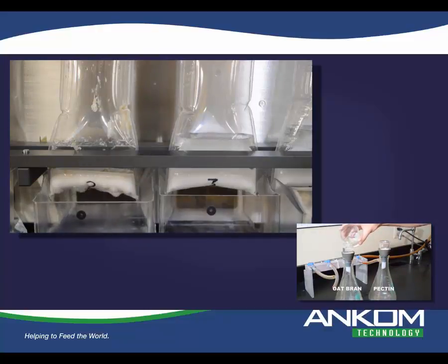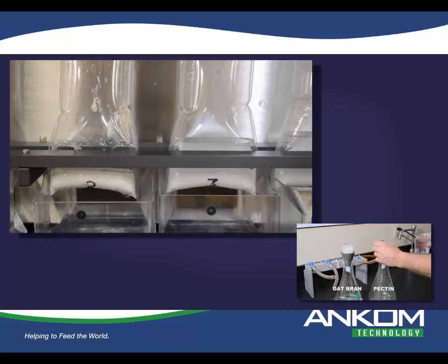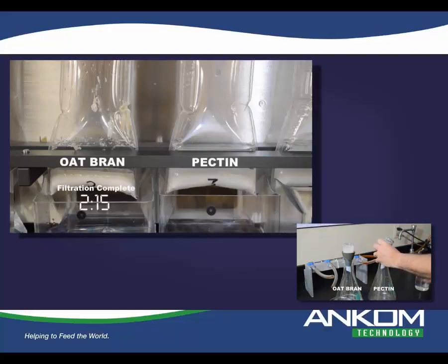When you do the filtration with the gooch crucible, remember you're taking a size of solution. For instance, in the upper digestion, when you're doing the enzyme digestion, you have about 50, maybe slightly more than that because of rinses, milliliters of solution that you're putting into the 60 milliliter crucible, which is fine.